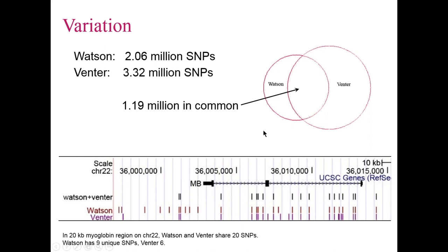You can query the table browser to intersect data sets — for example, creating a track showing where Watson and Venter have locations in common, and building up multiple intersections. A real-life utilization might be sequencing a trio: adding both parents' variants in a union gives you total heritable variation, and subtracting that from the child's variants gives a graphical representation of any de novo variants that arose in that child.